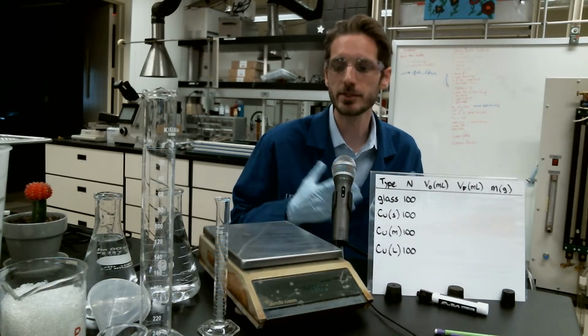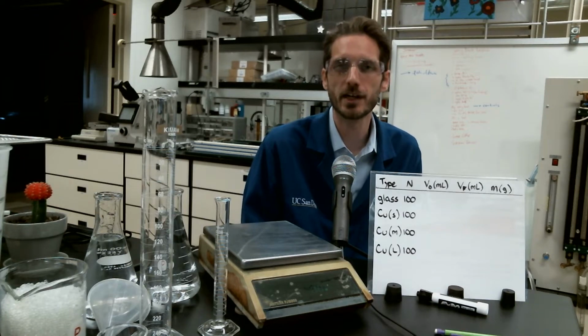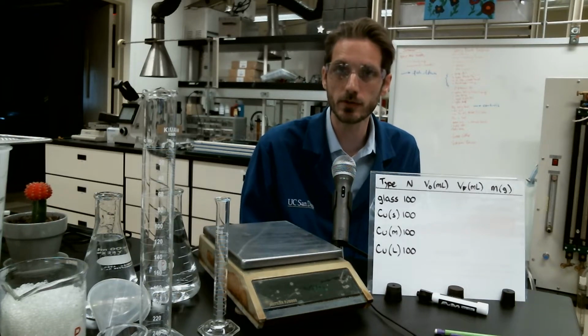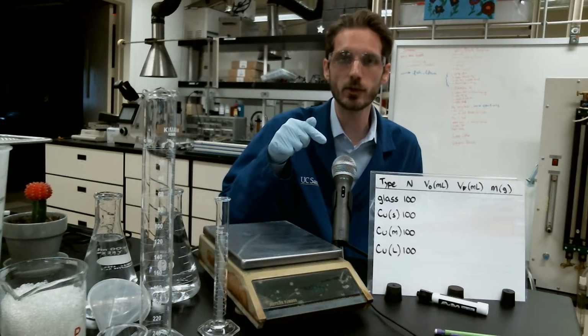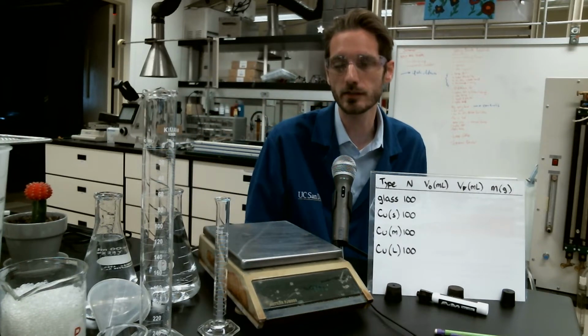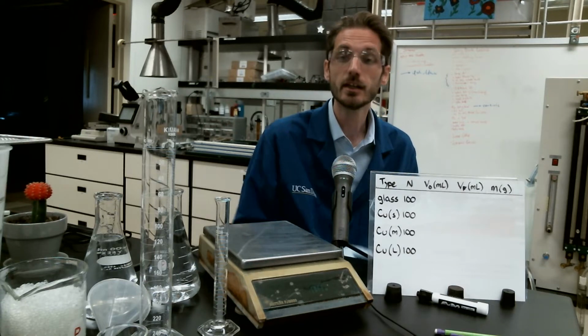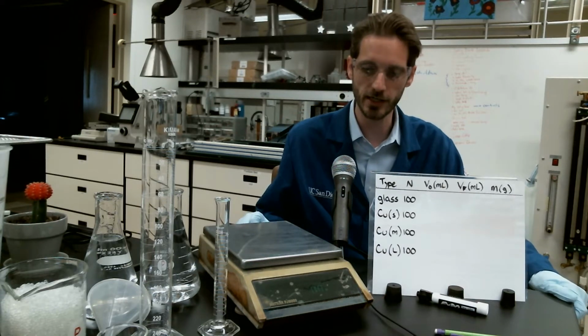Hey everyone, so let me show you what we're dealing with here. We're just going to try to make some basic measurements of density and average particle size. I've got a handy little mic here. I know it's a little bit loud in the lab right now. I'm going to run it through an audio smoother and see if I can't get rid of some of that background noise. But let me show you what we're up against here, what kind of stuff we're dealing with.